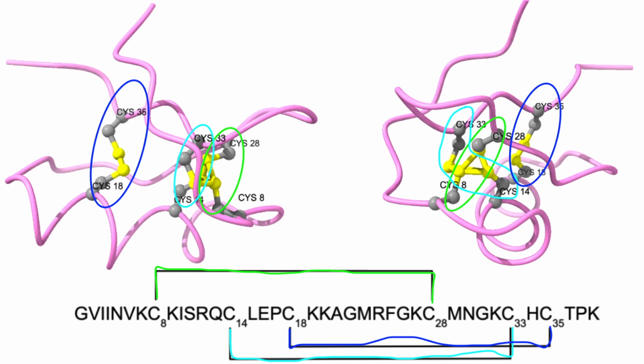This doesn't necessarily negate the findings and is more showing us that we need to further refine our structure in COOT, and that we probably just need better rotamers, because it's possible to pick rotamers that are allowable bond angles but also don't fit into the density map as nicely. So it is possible that I just didn't do as great of a job of fitting the toxin into the EM density map here.